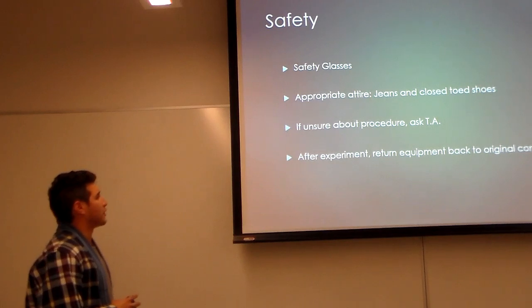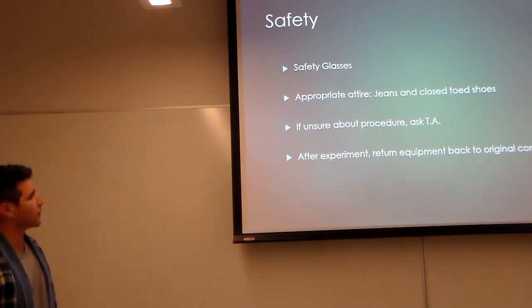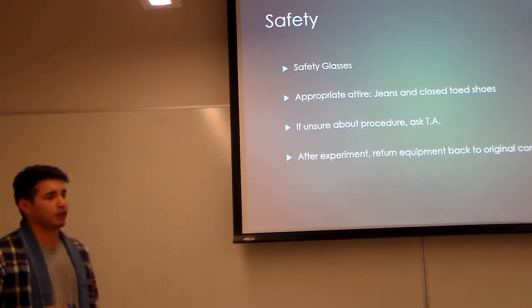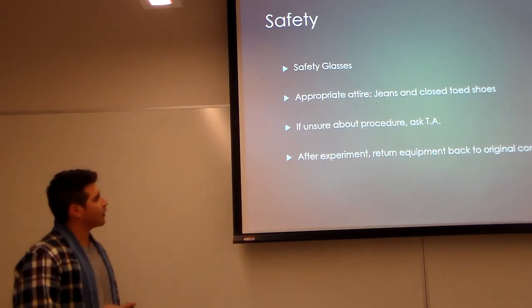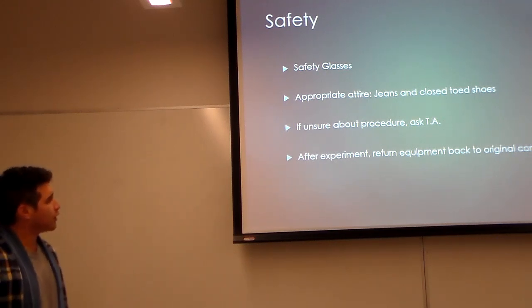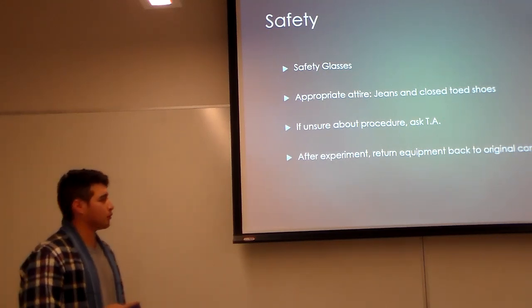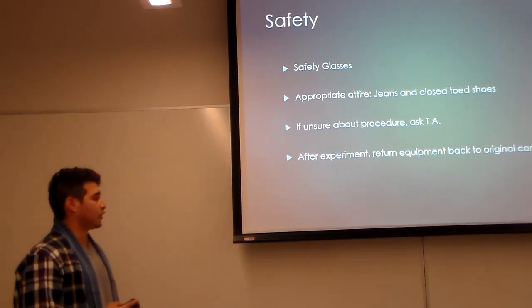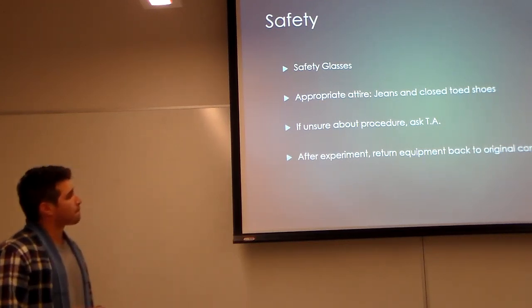Some quick safety tips: always wear your safety glasses, of course. Wear appropriate attire, jeans and closed-toed shoes. If unsure about the procedure, read over the manual and ask your TA. After the experiment, return equipment back to its original condition. Like I said, if you're unsure about the procedure, go back and reread the manual or ask the TA. We are dealing with a bunch of dangerous equipment.